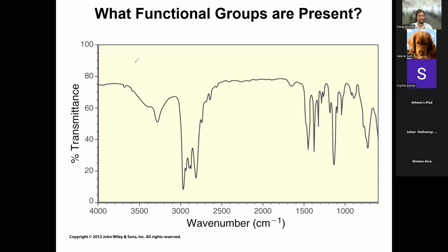That is correct. Yes, this is an NH peak right here. There's only one peak. It's not very strong. Remember, the strength, the y-axis, has to do with polarity, right? And nitrogen is electronegative, but not as much as oxygen. So again, if you're still confusing it with the OH, just remember that the OH peak is usually going to be more intense and more smooth.